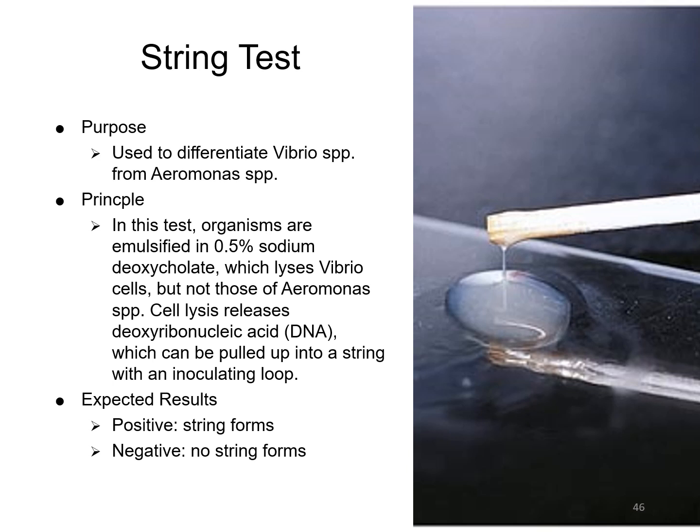If you ever did any sort of DNA lab in high school, you may have done something like this with strawberries or saliva, where you're trying to do a DNA extraction. This would be similar to that particular test method.